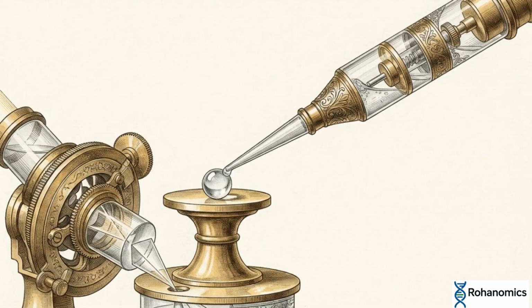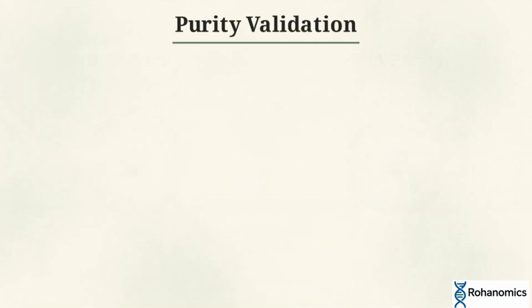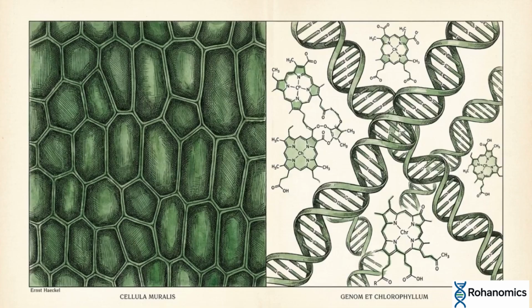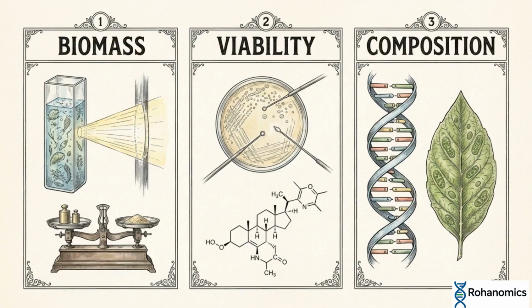Using a nanodrop instrument, researchers measure the total concentration of the extracted genetic material via light absorbance at 260 nanometers. They confirm purity by measuring the 260/280 nanometer ratio. 1.8 indicates pure DNA, and 2.0 indicates pure RNA. When rigid cell walls prevent physical isolation or liquid suspension, isolating and measuring the tissue's core biochemical blueprint provides a quantifiable measure of growth. This matrix organizes our methodologies, revealing the selection framework of quantitative biology.